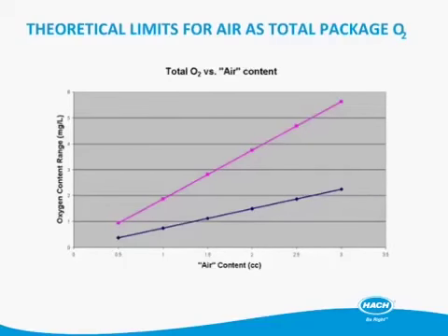And the air measurement can correlate fairly well to headspace air if you do a really good job and follow the ASBC method. The upper line, though, is what you would get if everything was in the liquid. If all that bubble of air was dissolved into the liquid, or what of it would dissolve into the liquid is dissolved in the liquid, then we would get the upper line. And you can see they're completely different. And since that resulting bubble is an unknown O2 ratio between the headspace and the liquid, we end up with a value that really is hard to correlate back to any other kind of measurement.